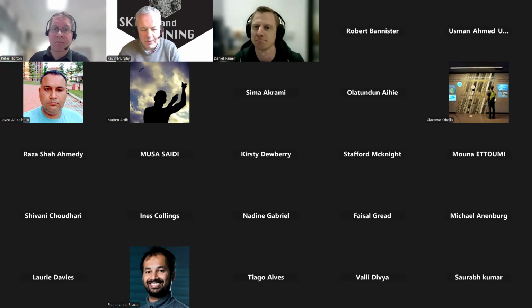Yeah, the mud rock sounds very familiar for people who are interested in reading about clay science, that's for sure. Seema also has a question. Is it part of your plan to create a database centered on electron diffraction? That's not particularly needed to be centered around electron diffraction, because everything that's been published goes into the already established databases, the CSD and the ICSD.